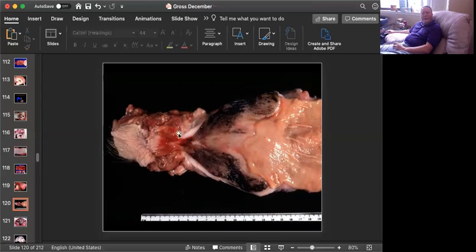You have a lot of hemorrhage here. The animal's been straining to pass stool, so there's ulceration. There is hemorrhage. So how do we get to this? Well, this is a classic lesion of rectal stricture, which is the result of infection by Salmonella typhimurium, a non-host adapted salmonella which will infect a wide range of species.